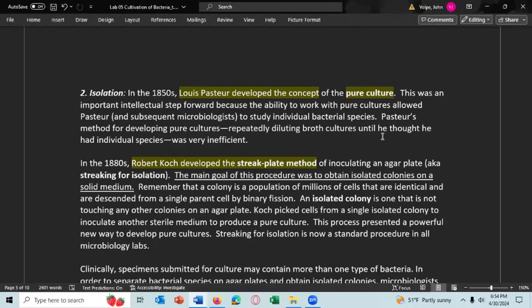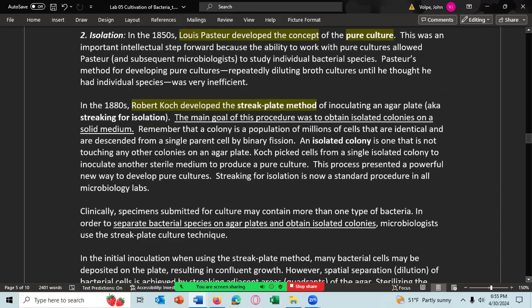So if you want a pure culture, you streak the cells out on plates, not once, but 2 times, so that the cells go through 2 colony formation events. Any question about any of that? And then once that happens, you can say you have a pure culture. And it's greater than 95% accurate, meaning you have a less than 5% chance that you'll have a mixed culture. But there is a slight chance that you'll have a mixed culture. Any question about that?